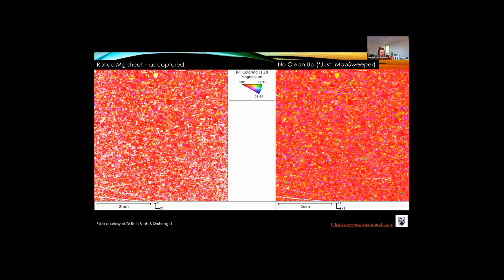So keep your samples nice and clean, and check there's a good ground. And the secret bit of the ground is it's not necessarily the foil being held by the grippers. It's perhaps the grippers and other bits and pieces. So see whether you can ultrasonically clean all your holders before they go in the SEM. And the last bit for drift type issues is thermal mass is important.